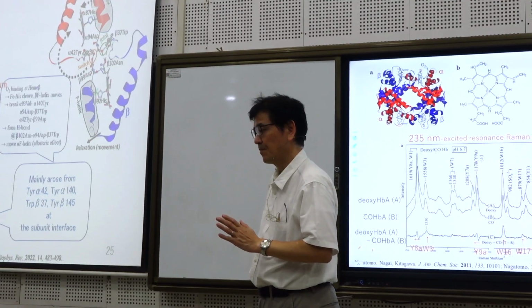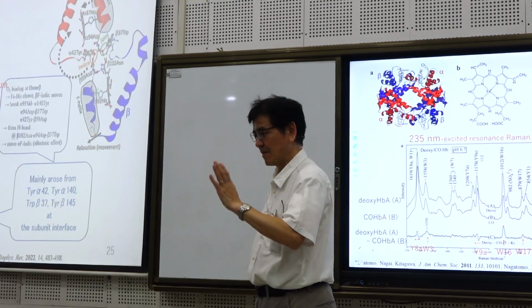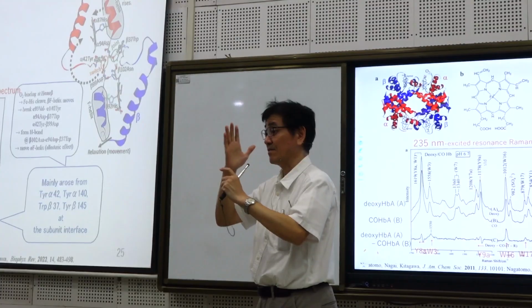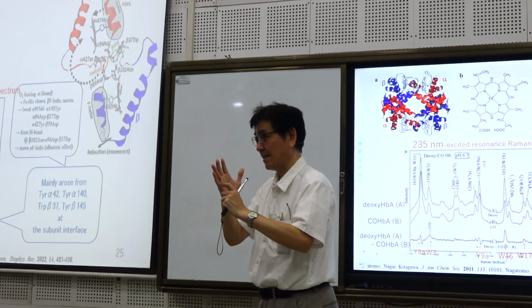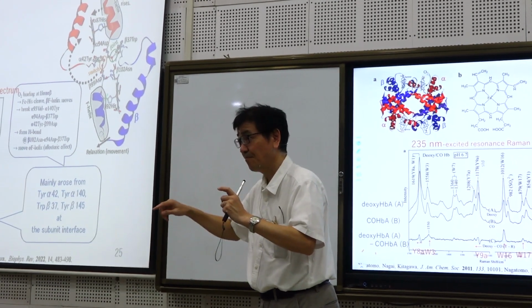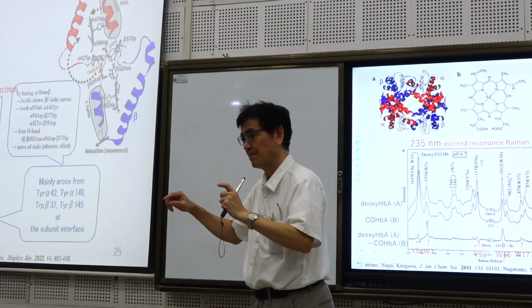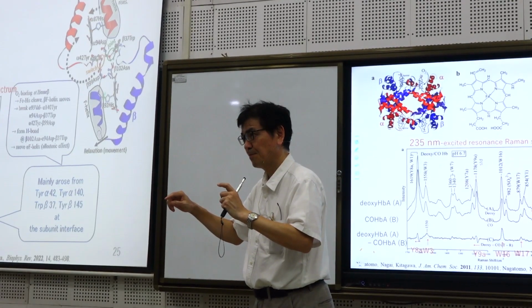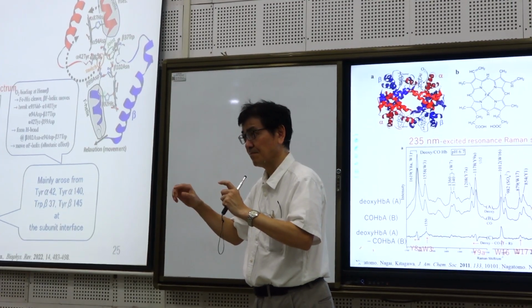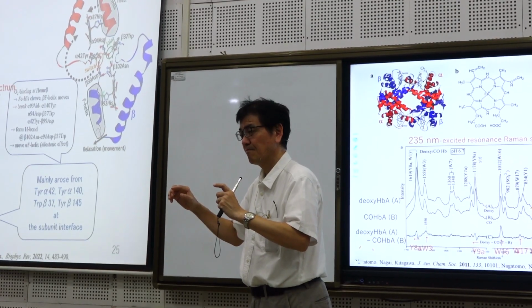You mean you have one laser with a certain wavelength, and your sample has a different absorption. Yeah. Let's say the dye absorbs at 520 nanometers. Which wavelength laser should we try, 532 or 633?